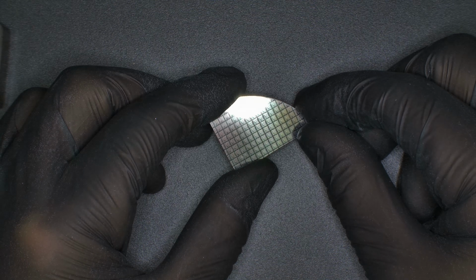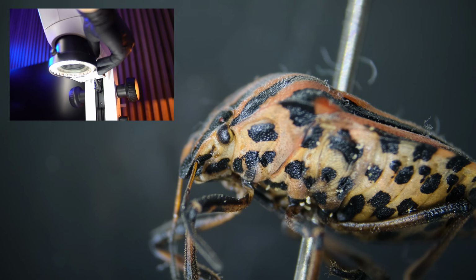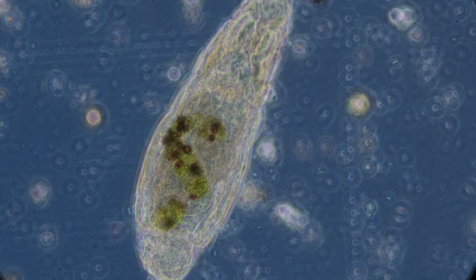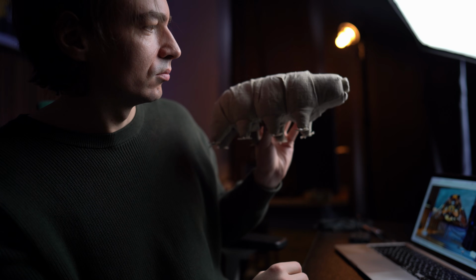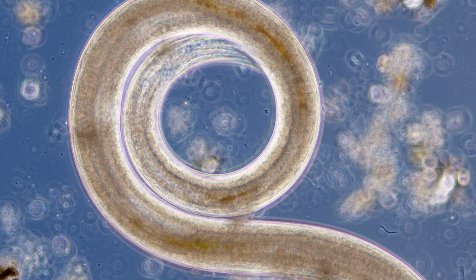A piece of a silicon wafer, microelectronic components, metals, polymers, rocks and minerals, insects. These are usually opaque objects. On the other hand, thin sections, living cells, prepared insect parts like a butterfly or fly wing, single-cell organisms, tardigrades, blood and similar samples. These are transparent samples.